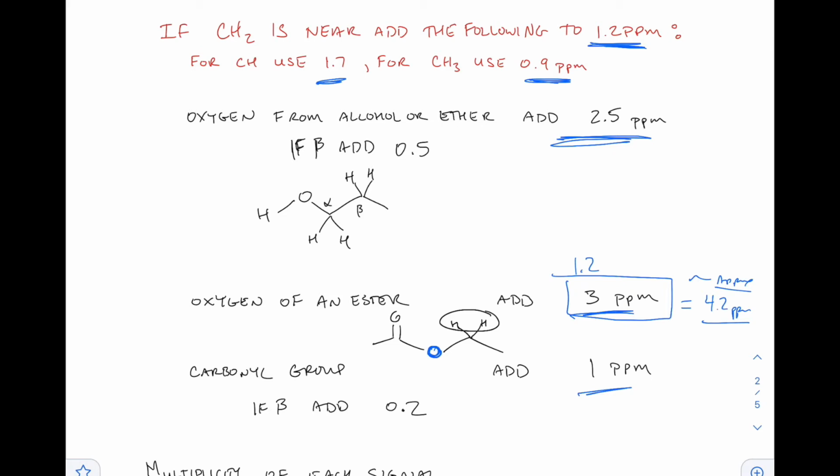Let's see, what do we got here? So notice I wrote an alpha proton or a beta, then that's going to put it in a different spot.